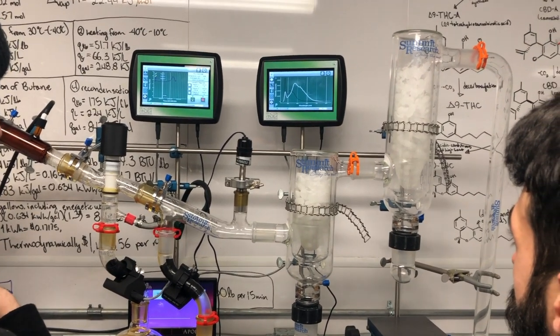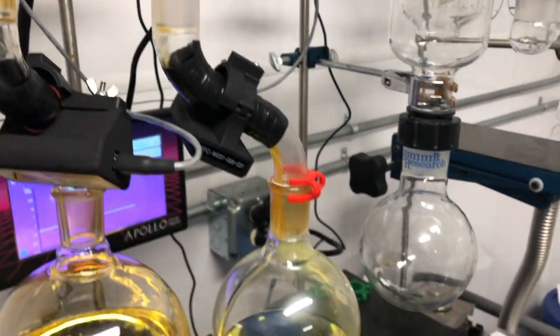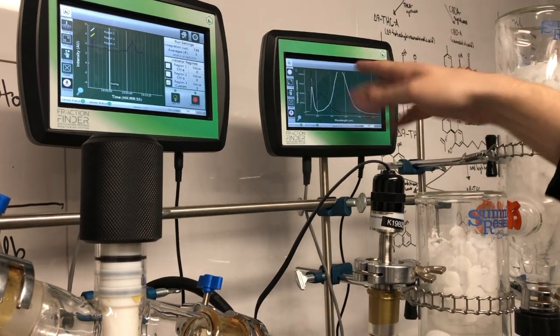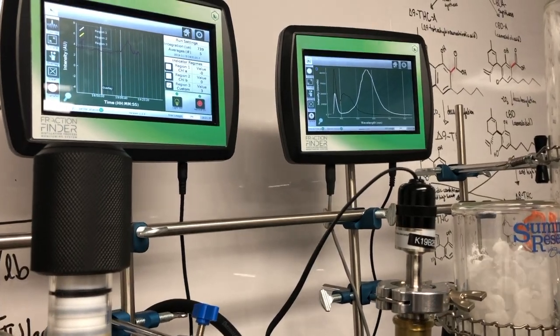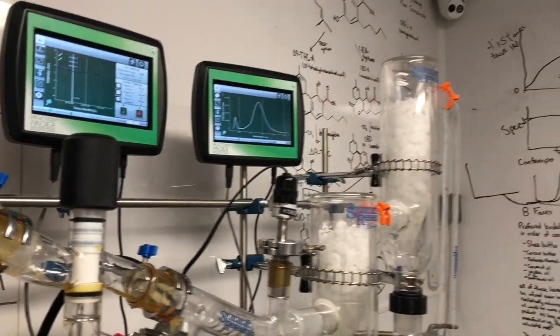Look, our traditional tails peak is coming in. You see how it's shifting to the right? We just have a big glob of tails that ran through at the very end of this thing that Adam heat gunned, and what you basically saw, this was before we heat gunned through the tails, and you just watched everything march to the right as we went through basically degraded cannabinoids to lipids to straight waxes and some of the heavier colorants.